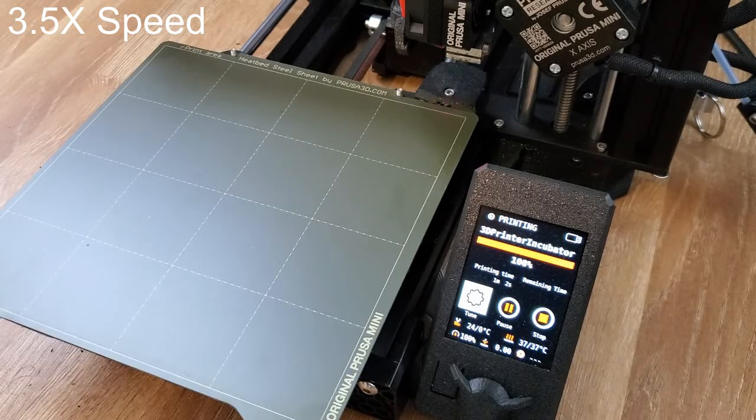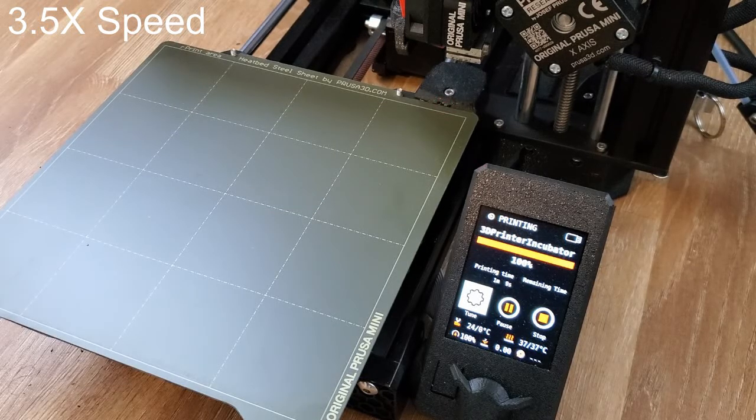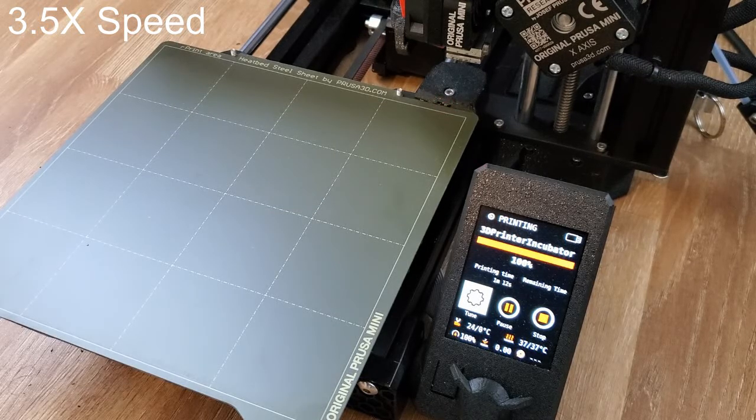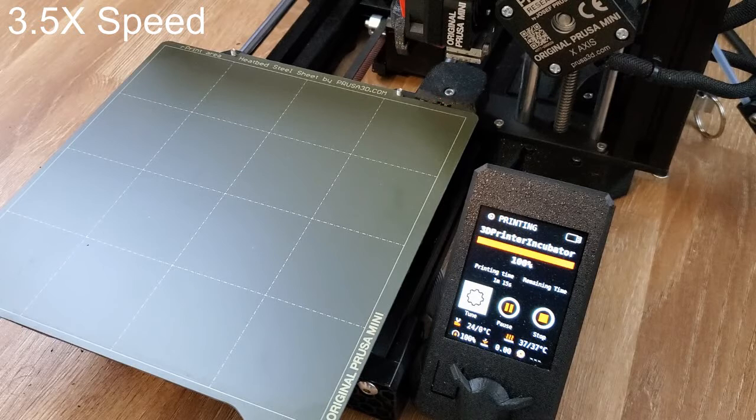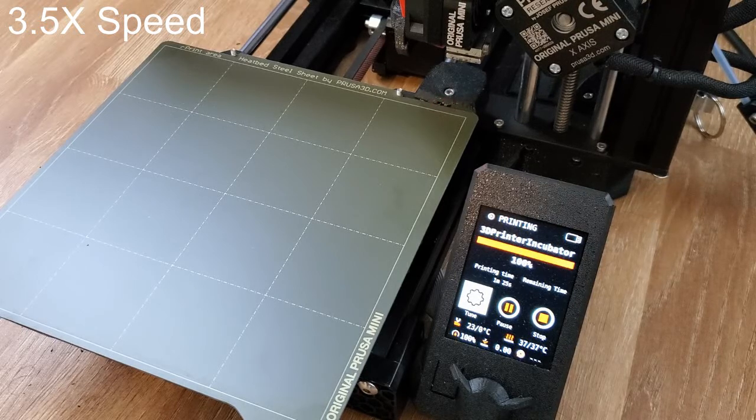You can change the timer to be as long as you want. I just did 60 seconds since it was a test. And that's it. That's all you need to turn the Prusa Mini Plus into an incubator.